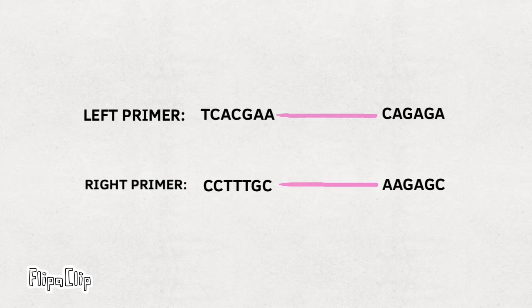Our second step is primer design. Primers are short strands of DNA that are customized and designed to fit specific nucleotides, around 20 nucleotides. Primers serve as the initial foundation for the DNA replication process. Two primers are used in PCRs and are matched to the segments of DNA. During the annealing process, primers attach to the top and bottom strands of DNA. Using the right primers is really crucial for the outcome and quality of the PCR.